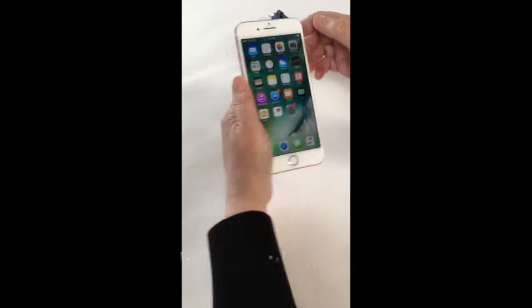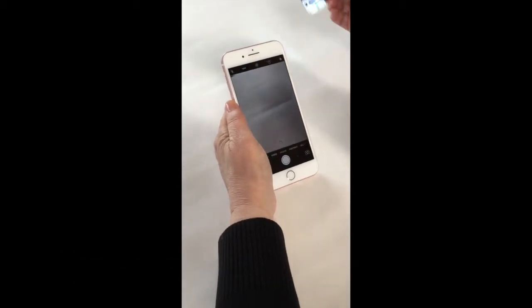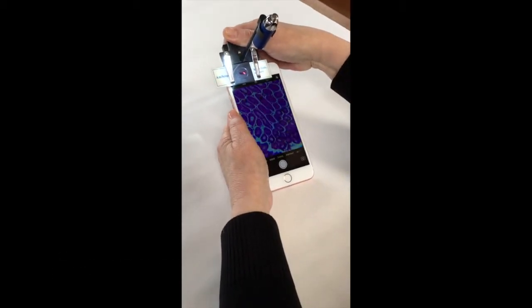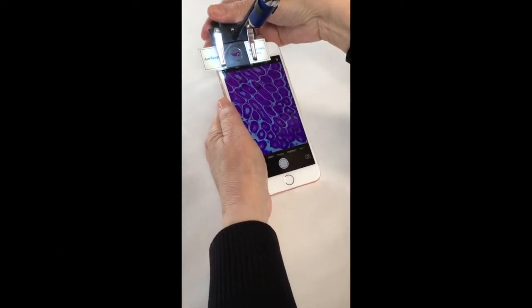First, align the slide onto the microscope using the clips. And then, turn on your camera, and then align the lens over the camera lens. You'll see it right on your screen. And then take a picture. Then you've got it saved in your photos.